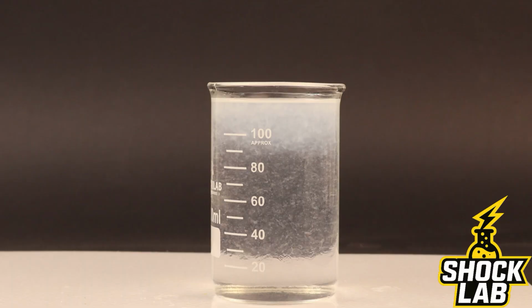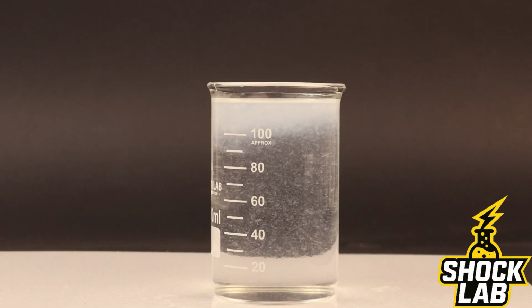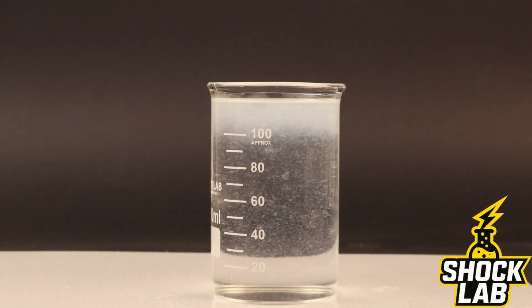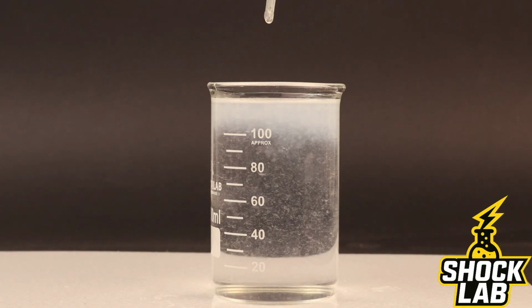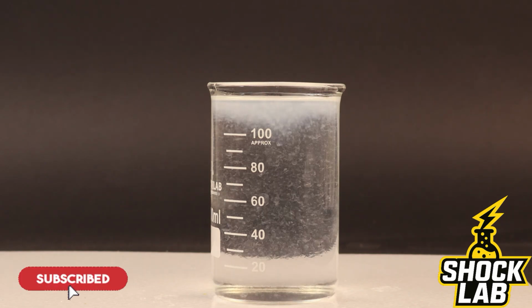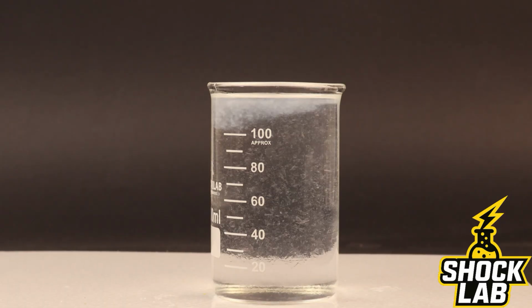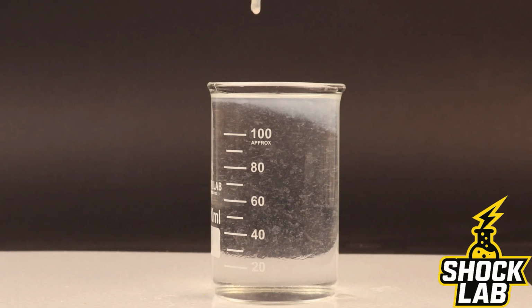The reason is that the acid converts the solid aluminum hydroxide back into dissolved aluminum ions, allowing the precipitate to disappear completely. This experiment is an excellent demonstration of precipitation and acid-base chemistry. By simply changing the chemical conditions, a solid can be created and then dissolved again in the very same container.